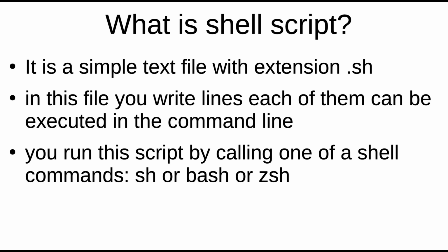You might ask, what is this shell script? Well, a shell script is a text file with extension sh. You write lines in this script which you can execute in your command line, and by saving it and running it, all these separate lines will be executed all together.